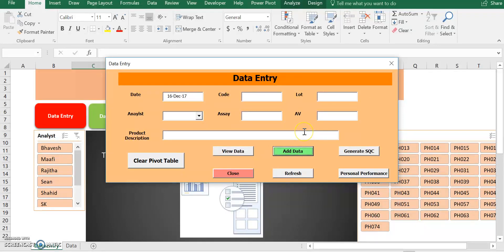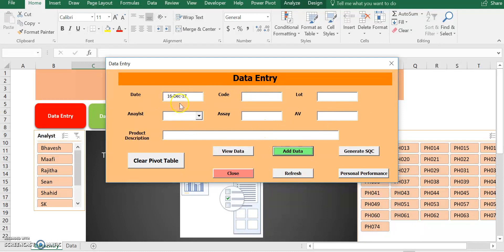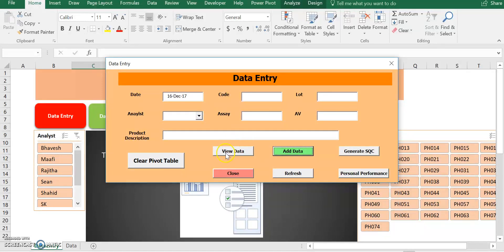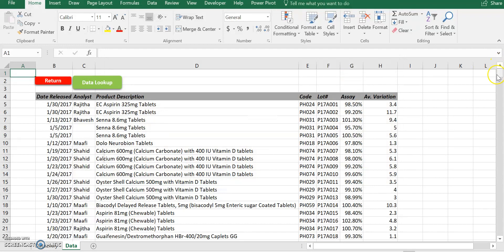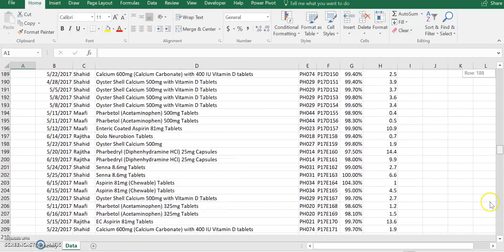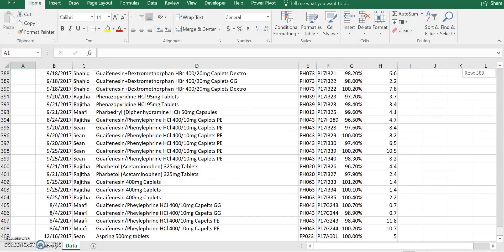So the VBA code was designed so that whenever I hit the add data, all these fields are cleared out except for easy entry. So we can go to our database two ways. We can either click here, view database, or we can close this out and manually go there. I prefer to just click here to view data. As you can see, it worked. Now I close my user form, and I scroll all the way down. Let's see if my entry is added. As you can see, my entry is added.